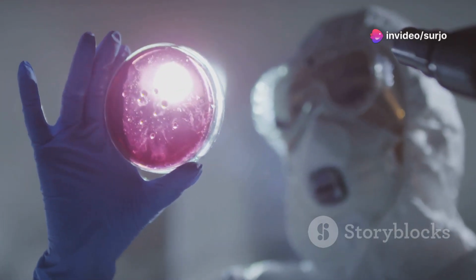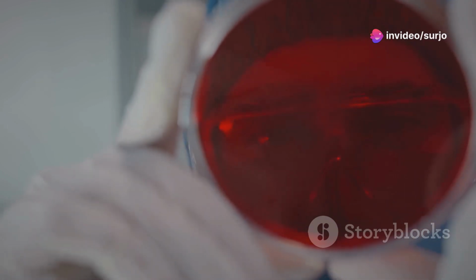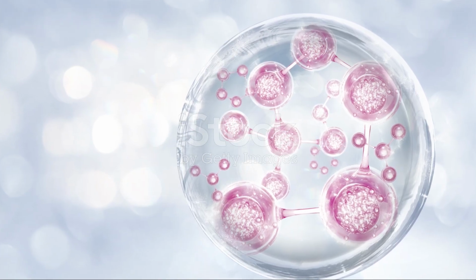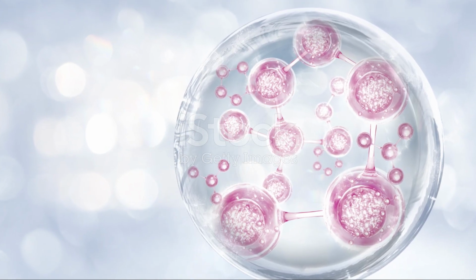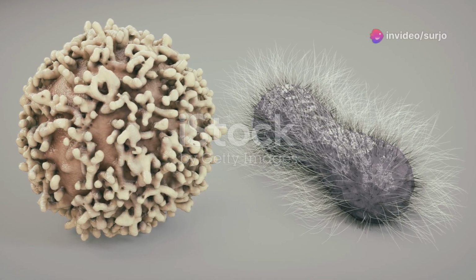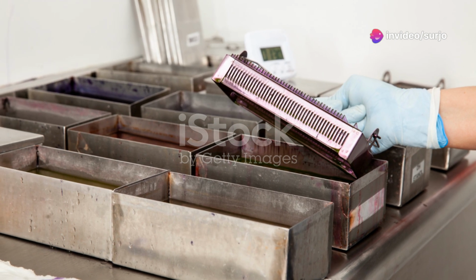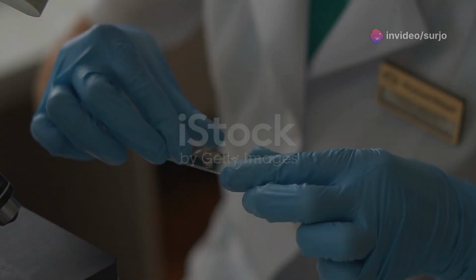Finally, a counterstain, usually safranin, a pink dye, is applied to the smear. This step stains the decolorized Gram-negative bacteria pink, providing a visual contrast to the purple Gram-positive bacteria. The counterstain allows for easy differentiation between the two groups under a microscope.